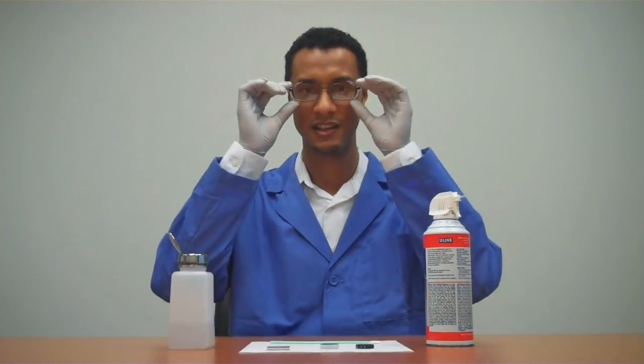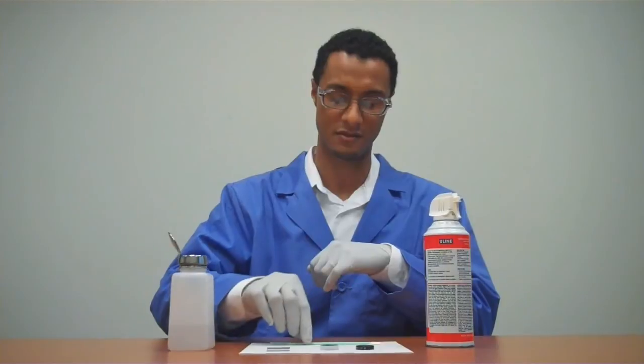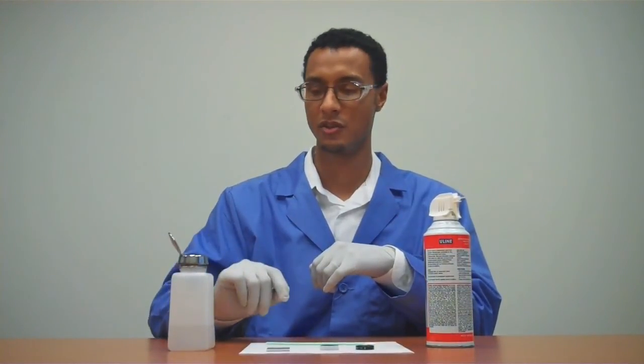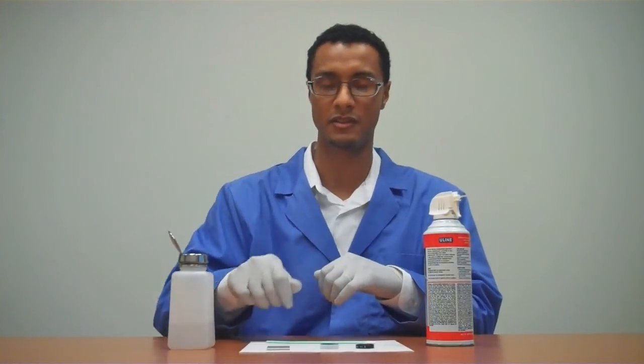Before we get started, we'll need a few things: safety glasses, laboratory gloves, compressed air, lint-free swab, cleaning solvent — isopropyl alcohol or acetone — and of course, Semrock filters.